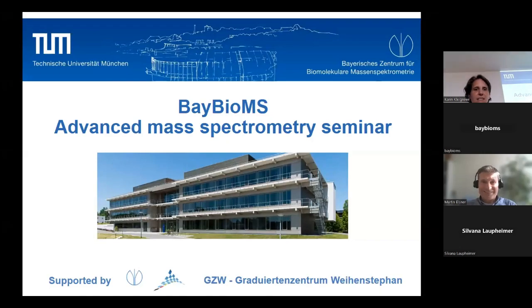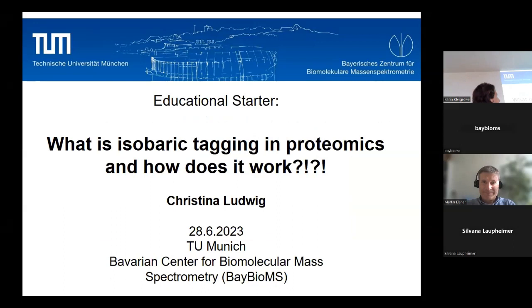Then I suggest we immediately get going with the educational starter. So those of you who have been in this seminar before know that we also always try to, depending on the people who present here in the seminar, give a bit more of a basic introductory lecture part where the technique that is used by one or several of the speakers is explained a bit more in detail. And this is what I'm trying to do now. And the educational starter is about isobaric tagging in proteomics.